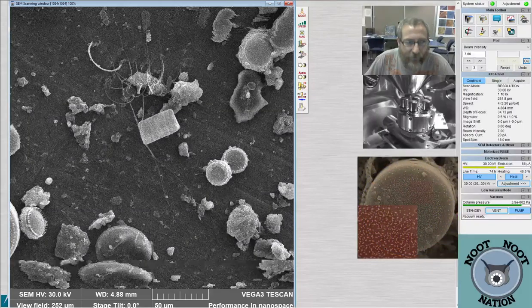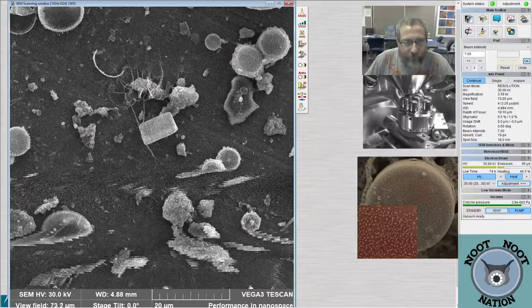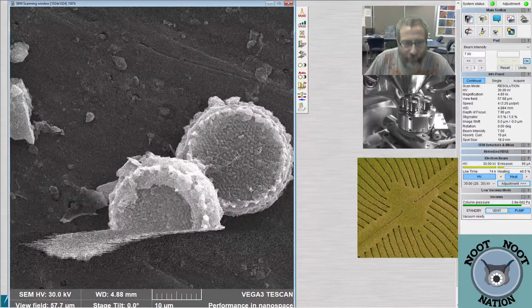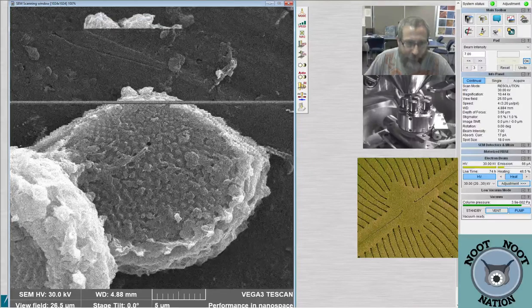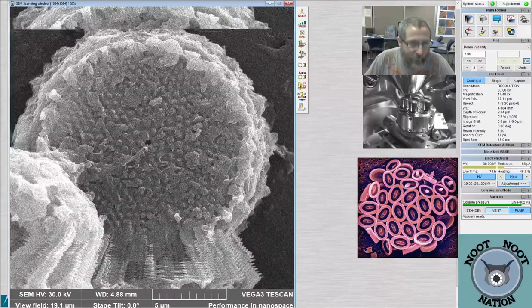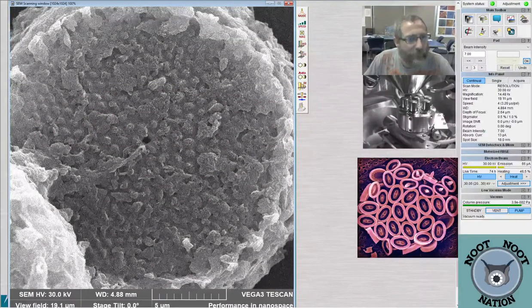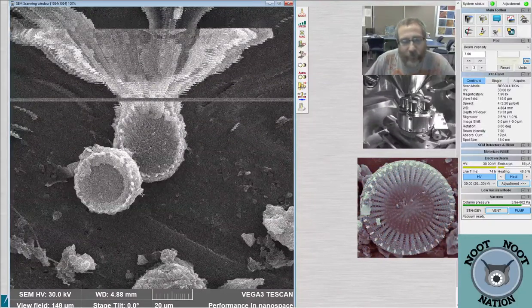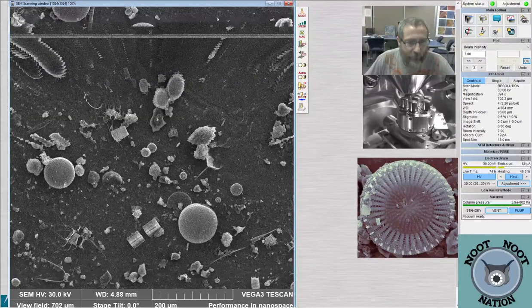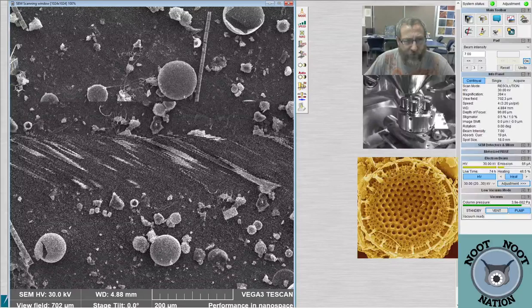There's another one of these. Maybe they're common enough that we could actually get some. And then there's these things, which are the little thalassiosira-like things that are always clustered together in a little clump. Are those the clumpy ones that are covered in goo? Yes. I'm pretty sure, based on the size, it's only maybe 20 microns across. And when I was looking at it on the mounted samples, the surfaces look pretty much like this. So we'll take a look at some processed versions, because they were pretty common in the samples as well. So maybe we'll find some that aren't covered with goo and can actually see something. And then this coil up here is, I think, Eucampia, right? Yeah, it sure does look like it.